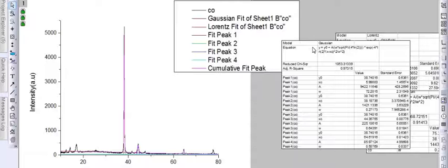Now one very important thing is, in case you are taking the raw data and following these steps which I already told you, and then you come across a problem in the peak fitting, because the COD is not close to 1.